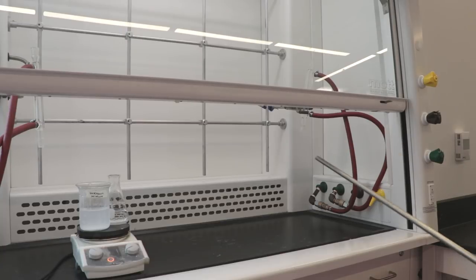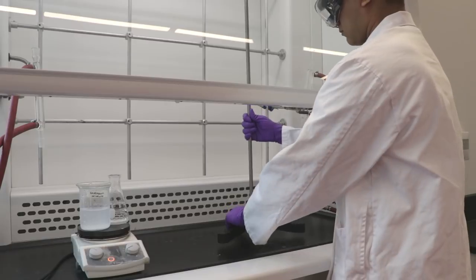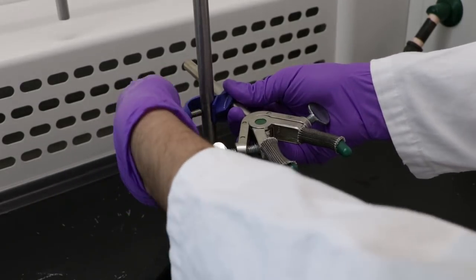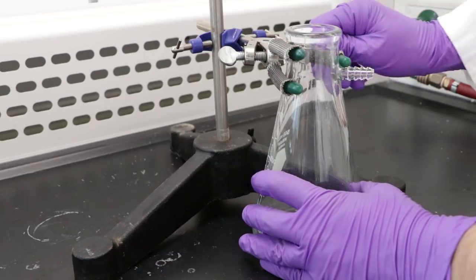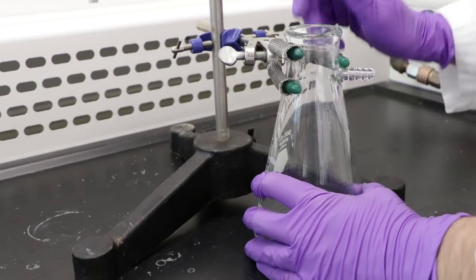To set up the vacuum filtration apparatus, carefully place a retort stand in the fume hood. Attach a three-prong clamp to the bottom of the retort stand. Attach the vacuum filtration flask and secure the clamp around it.